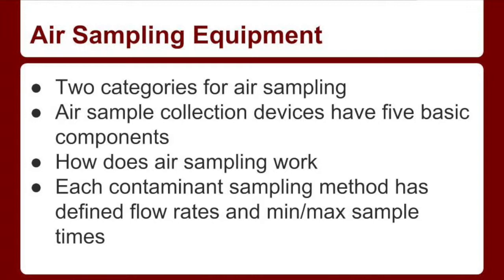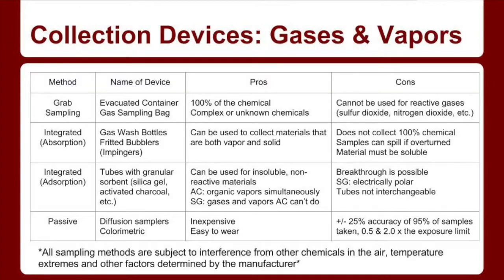It can also cause particulates to bounce off the media. Too low or too high a flow rate can cause a particulate sampler to collect the wrong size particles, rendering the sample invalid for comparison against exposure guidelines.